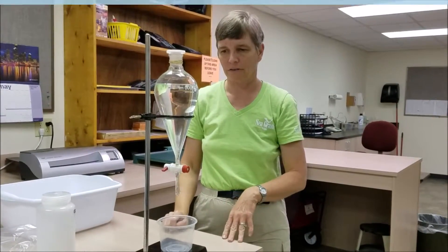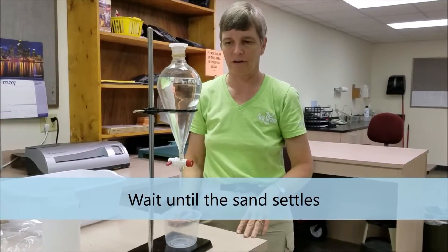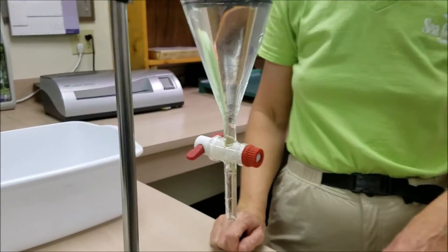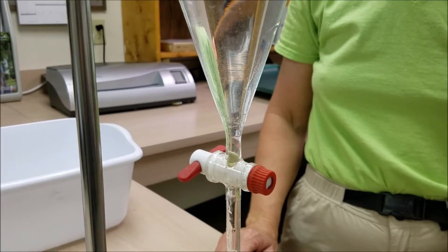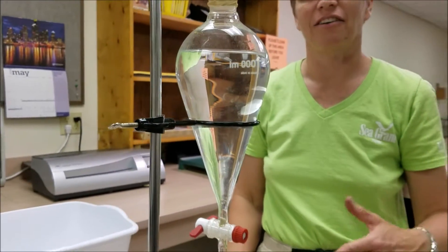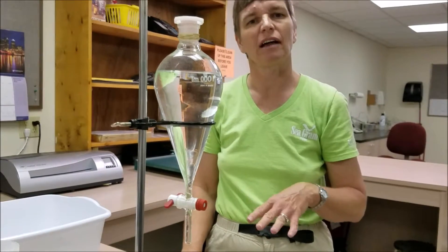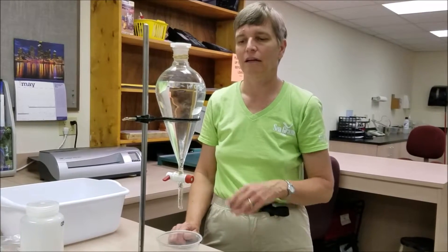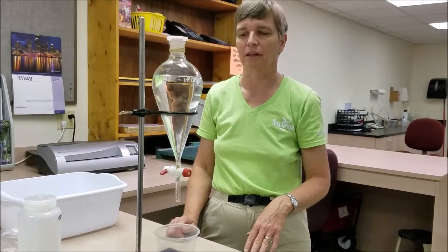We're now going to wait a minute or so. As you can see, the sand is starting to settle in the bottom of that funnel. You may need to leave it sit for five, ten, twenty, or thirty minutes until the sand settles. If you have a lot of fine silt in there it can take several hours — you might even want to leave it overnight. But the heavy sand grains tend to settle relatively quickly.